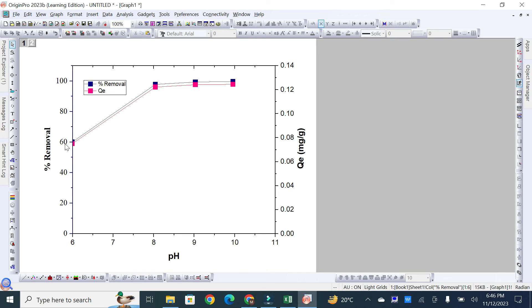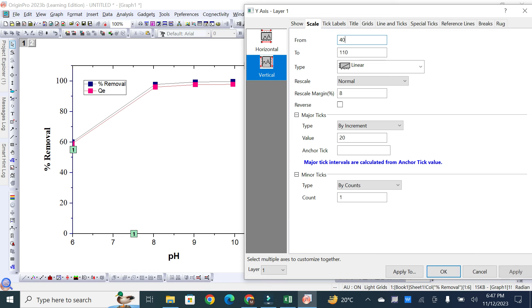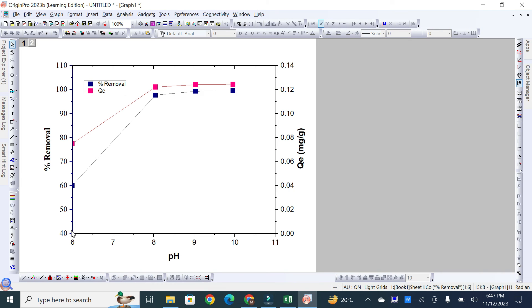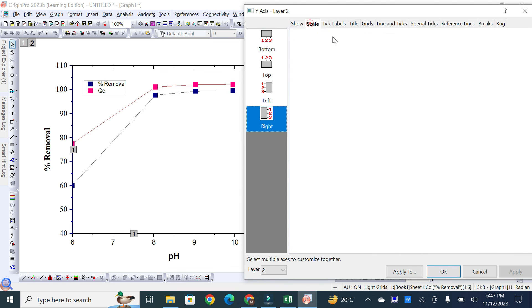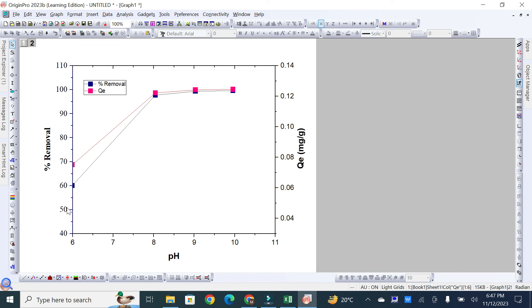To remove extra space on the Y-axis — for example, percentage removal starts at 60% but the axis starts at 0 — simply change the axis start value to 40 instead of zero. For the QE Y-axis, the first data point starts at 0.04, so you can change the axis start to 0.03 to remove that extra space. You can adjust these values as needed, for example starting from 50 and 0.04, to format your Origin Pro graph clearly.